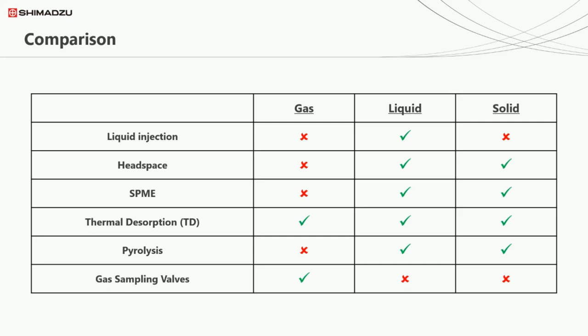A final consideration is maintenance. Cleaner introduction techniques, such as headspace or SPME, put considerably less strain on the GC and reduce the frequency that maintenance is required.